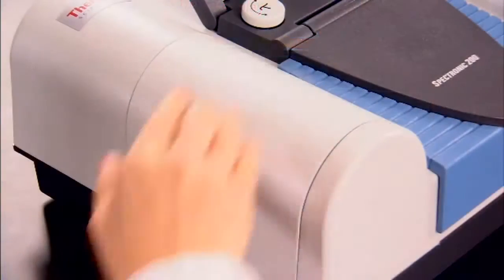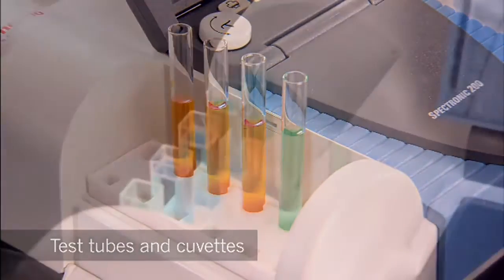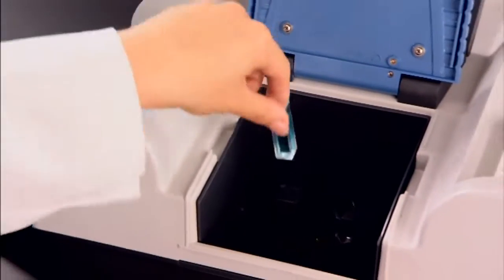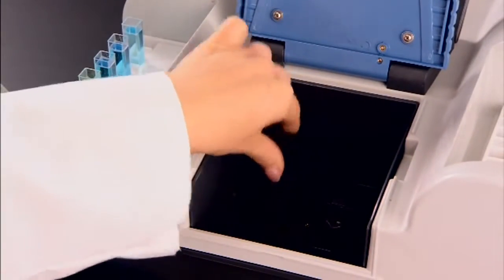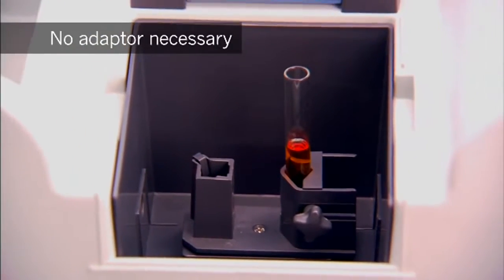The SPEC 200 includes racks and compartments for test tubes and cuvettes that make prepping and testing easier to do and manage. The larger, more accommodating sample compartment accepts cuvettes and test tubes of varying sizes — no adapter necessary.